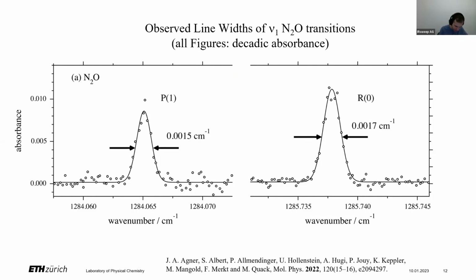We have a bunch of new questions coming in the Q&A. Jean Clément asked, very nice talk. The results are really impressive. How much time did it take to realize the spectrum while combining a good spectral resolution and a good time resolution? Do you remember how long those measurements took, Karen? No, I talked a bit with Pitt about it, and it depends really on which of the ones he was measuring. But I'd ask him more about it and ask him how long it took precisely. The only thing I can do is compare it to the FTIR, and it works out to be significantly less.